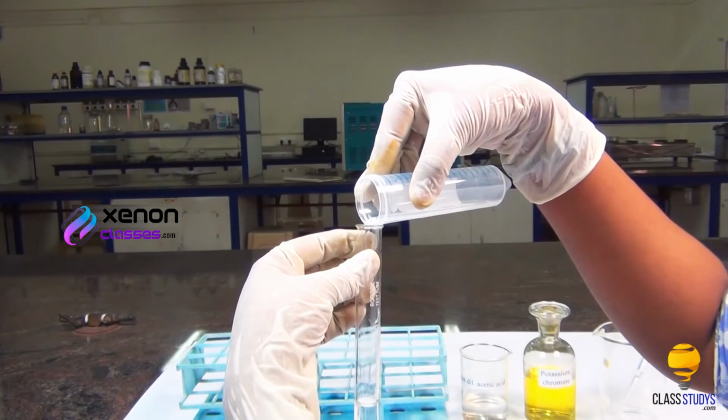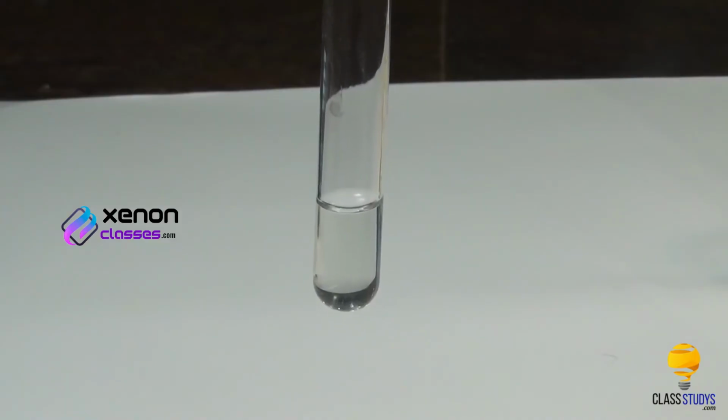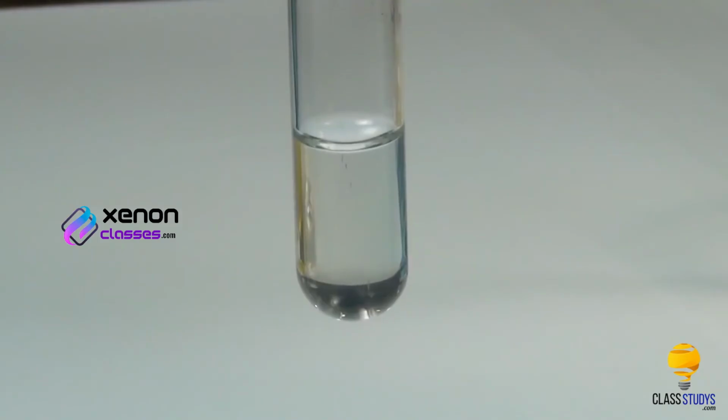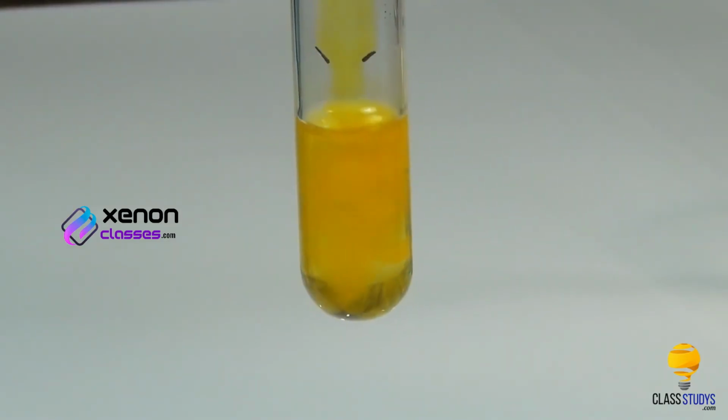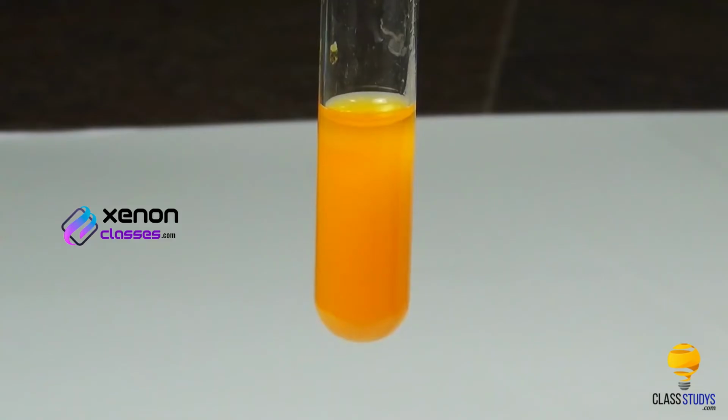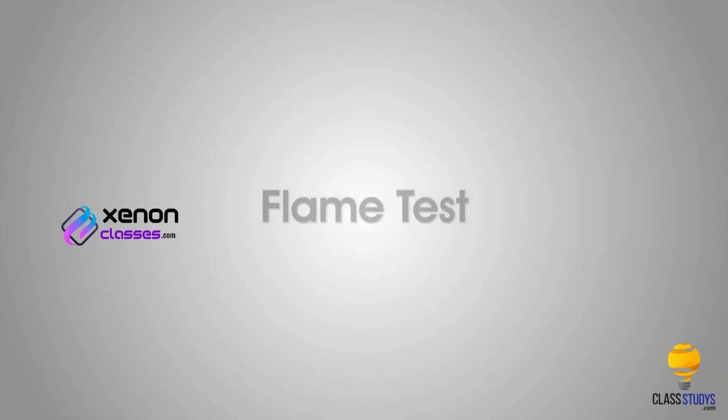Now, transfer the solution into a test tube. Using another dropper, add a small quantity of potassium chromate solution to the test tube. Barium acetate reacts with potassium chromate to form a yellow precipitate of barium chromate. Flame test.